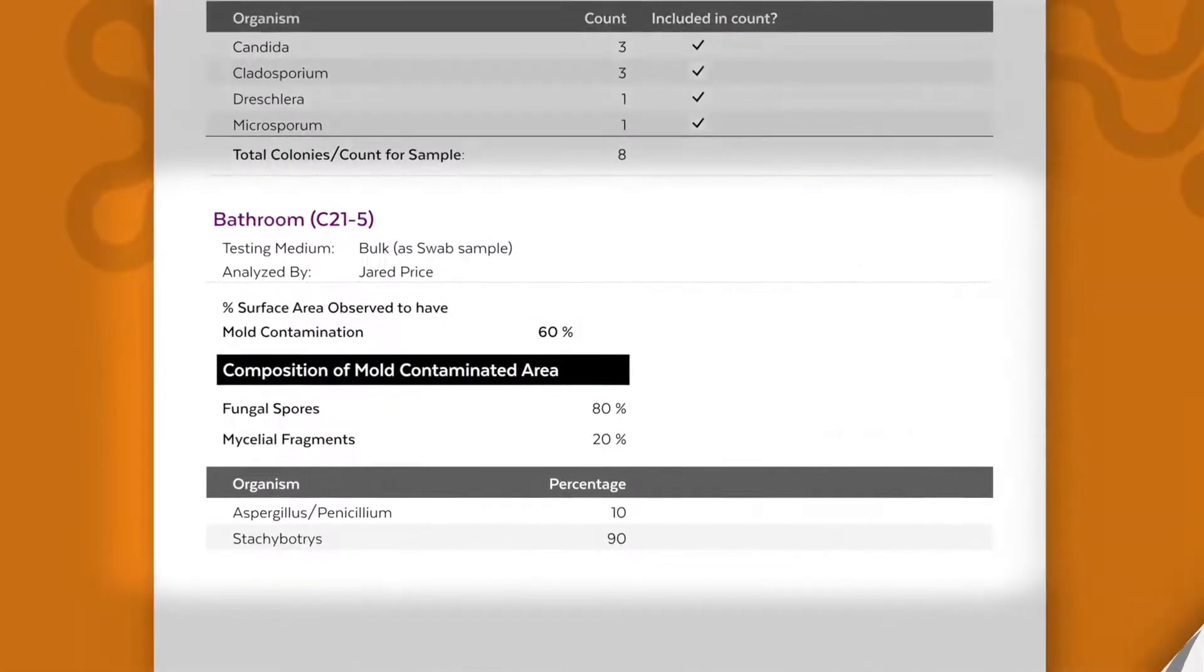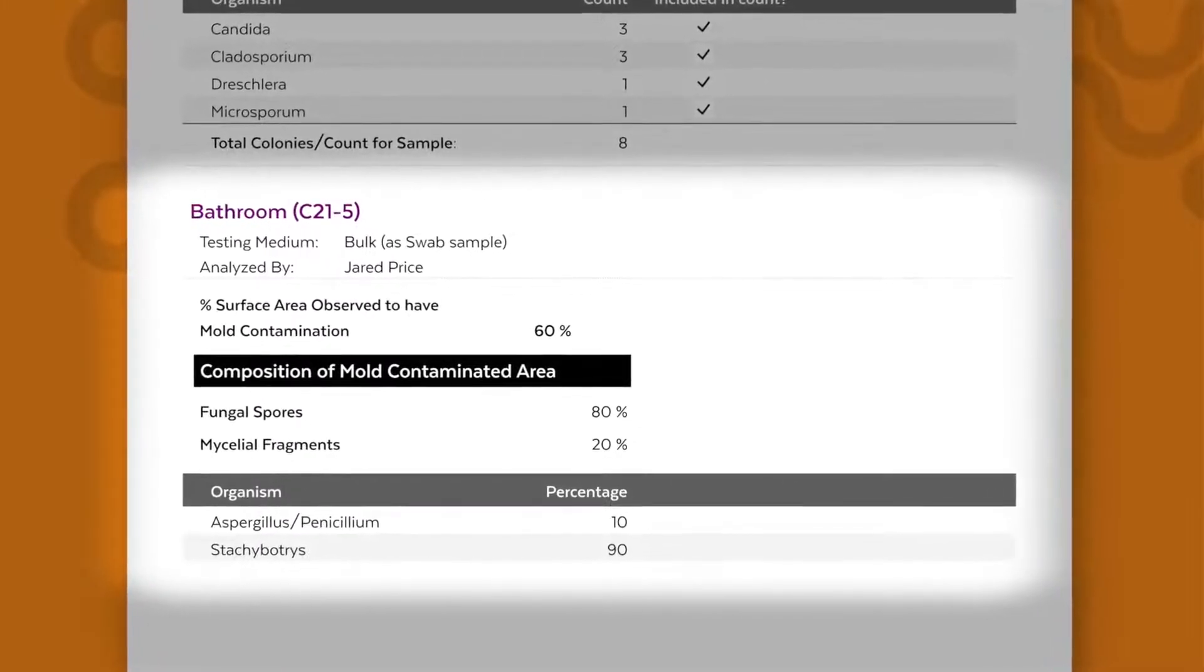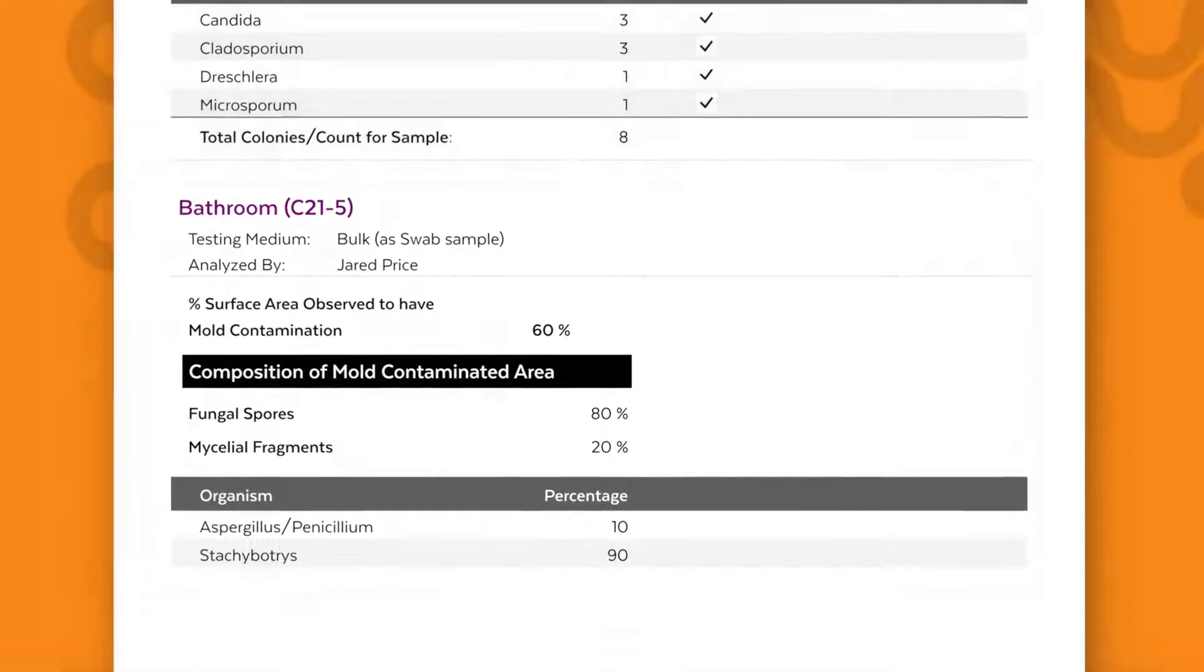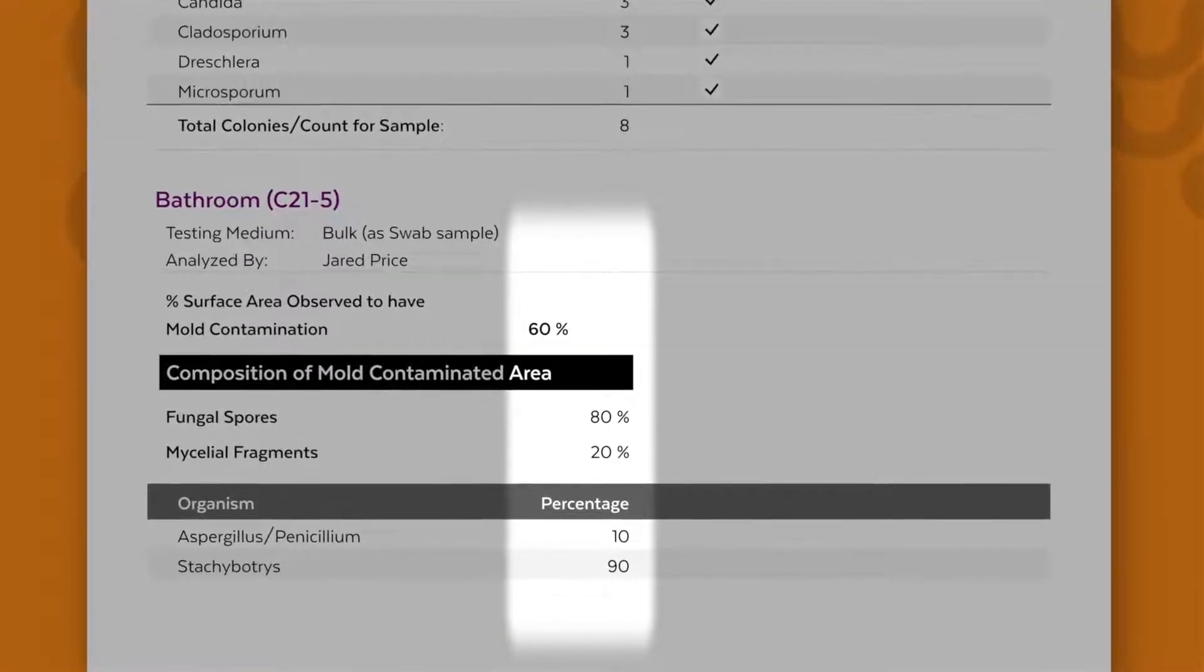Any swab samples will be listed as well. Swab samples or bulk samples don't include counts but rather percentage present. We'll cover how to interpret swab samples in just a moment.